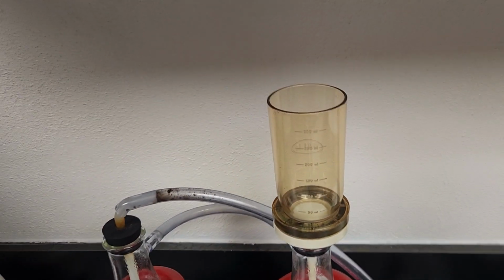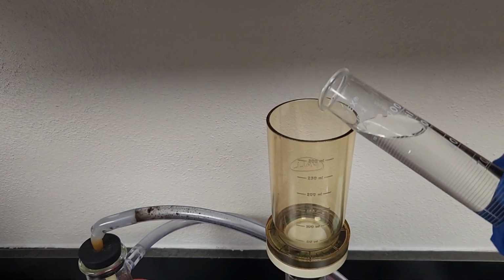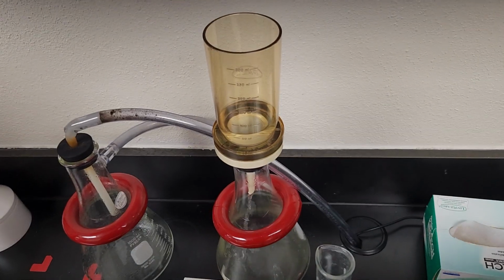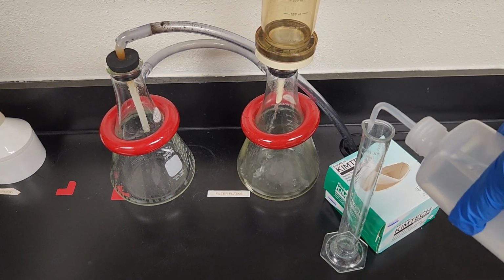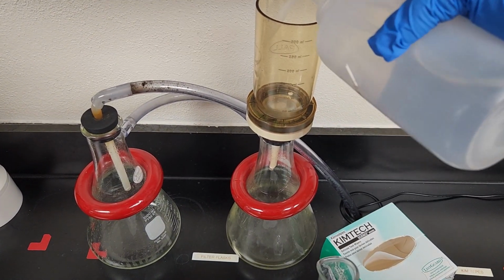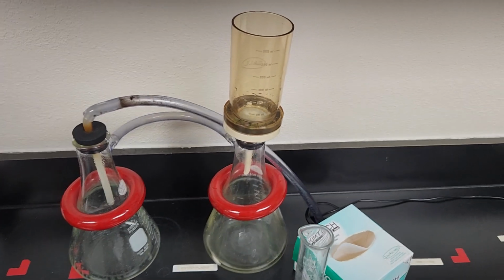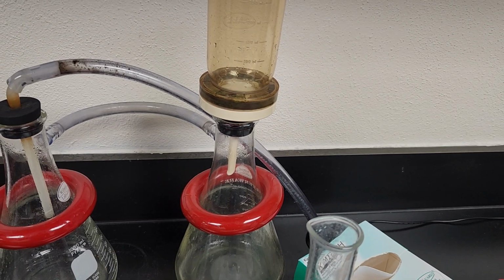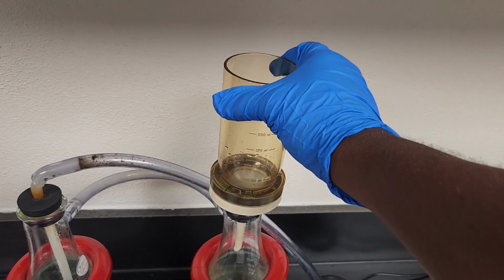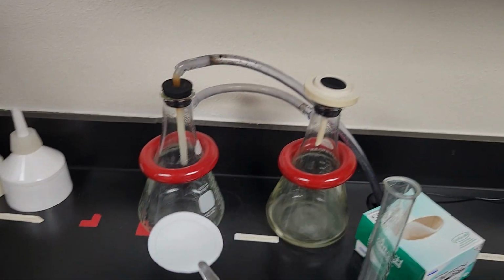So now we'll pour in our sample. Before we pour in our sample, turn on the compressor, the vacuum pump. We use the deionized water to clean the inside in case of any residuals. If it's good to go, turn on the vacuum pump. Collect the filters with the sample solid on it. Place it in a tin can.